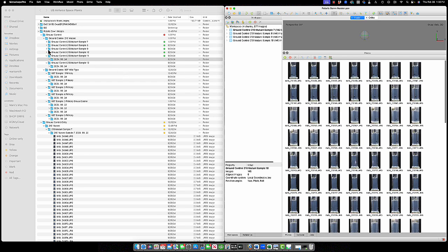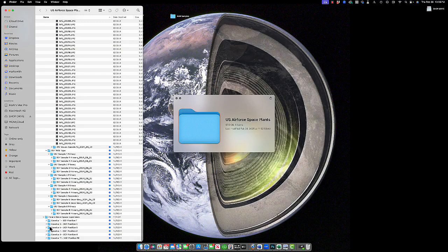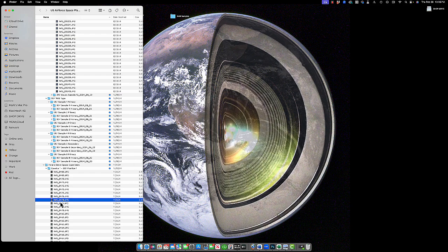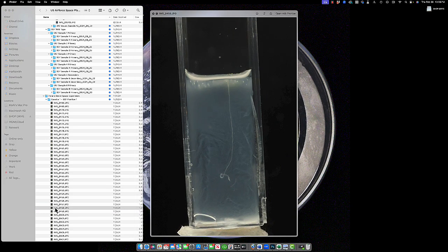And all the other images are good. Again, mark it green, move on to the next one. I probably won't show you this process for every single image because it's going to be somewhat time consuming. But what I'd like to do is at least show you the steps that I'm going to be taking so that they can be replicated.